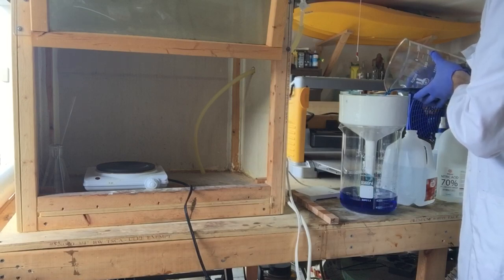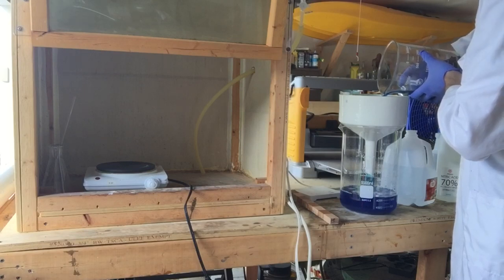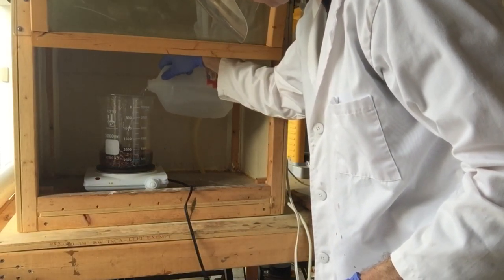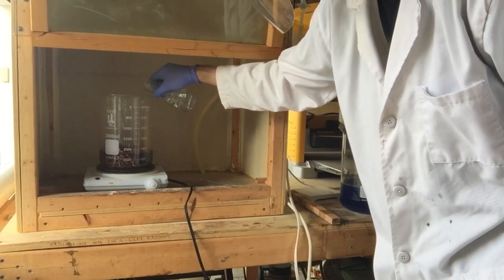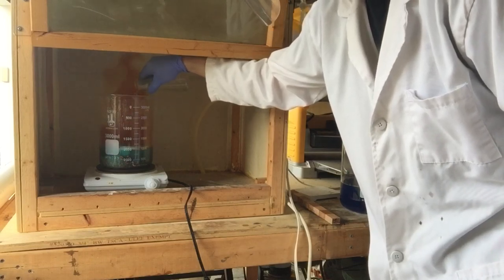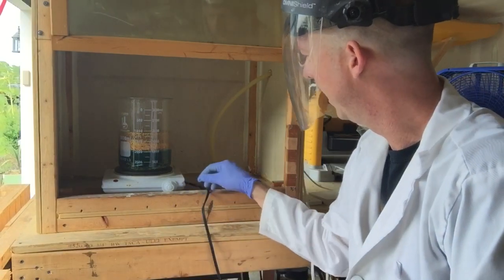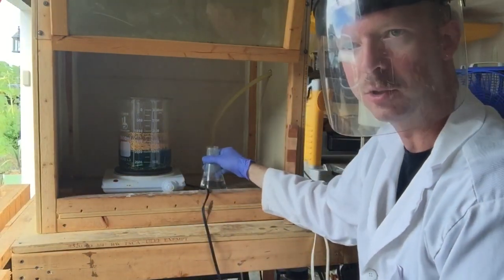I'm using the same filter as the first time to catch all my gold foils. I've got 200 more milliliters of nitric. I'll let this cook for a bit. The reaction already kind of died down, so I'm going to slowly add 200 more milliliters of nitric acid and try to get this to a rolling boil.